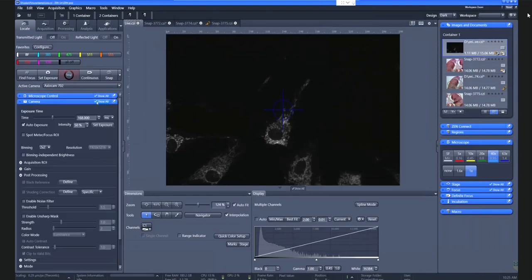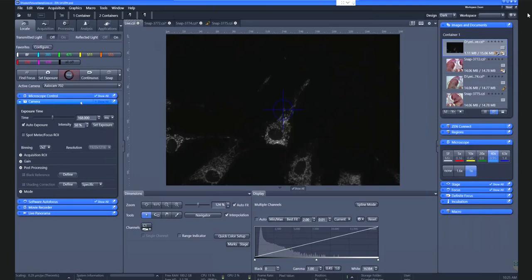As we can already see here, there are more options coming with this except the white balance, because this now is a camera which does not give us RGB channels, but just black and white intensities. So it's intensities only. If we look down at the histogram, we do see again 0, and the brightest spot would be in the range of 16,000 something. So this is showing me that this is a 14-bit camera.